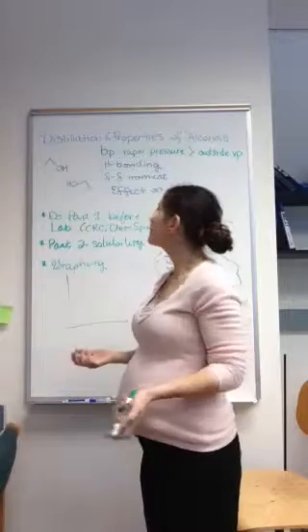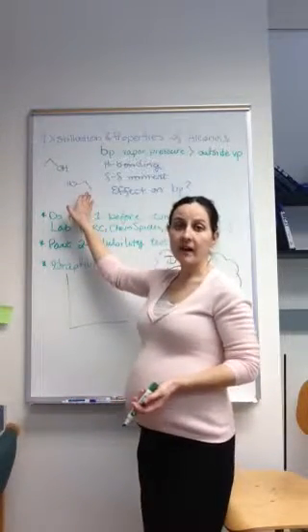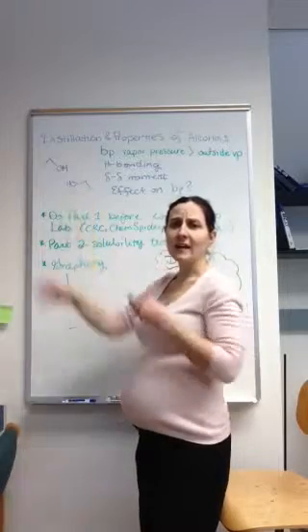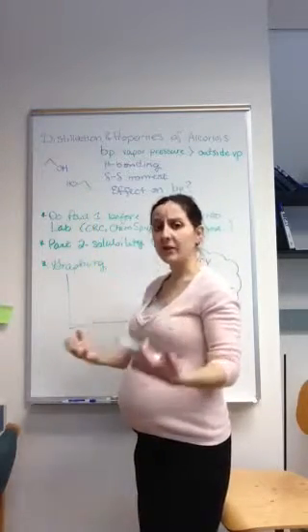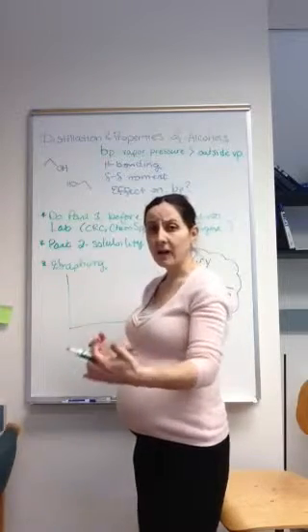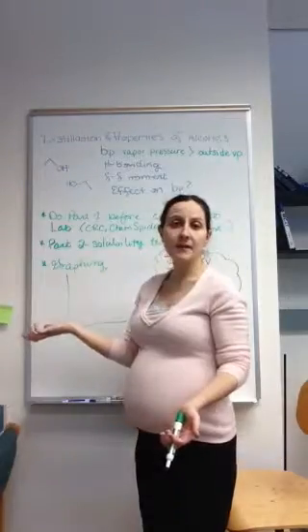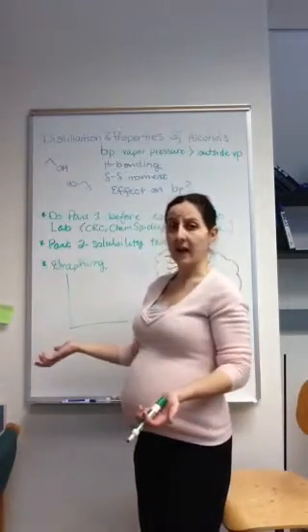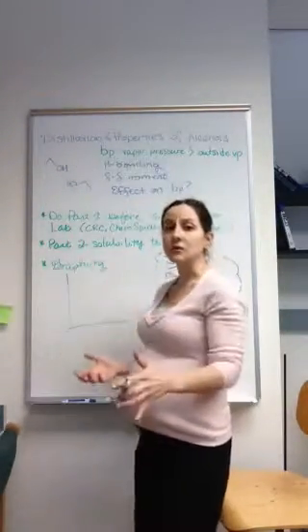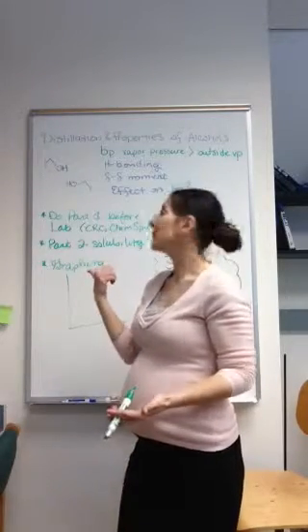Before we start adding metals, I have my bond line structures of ethanol. If it's floating around in pure ethanol, it can undergo intermolecular attractions to other ethanol molecules. In this lab, you're going to be dissolving compounds in water sometimes, so it can also do those same interactions with water and with other ethanol molecules.